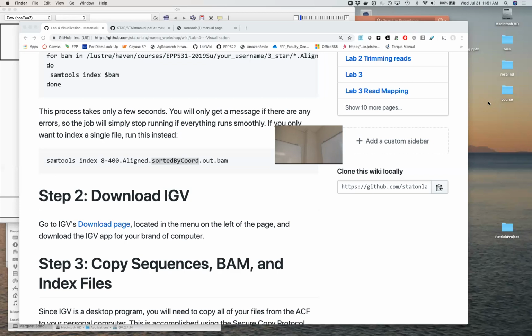Okay, now if you zoom in, you should start seeing alignments, which you can do again with the plus button. Yay! Alignments! And look at all of those reads mapping right on top of the exons of that gene. Okay, screenshot, almost done. Yay. You can also zoom in and look at more things. You don't just screenshot it and give up.